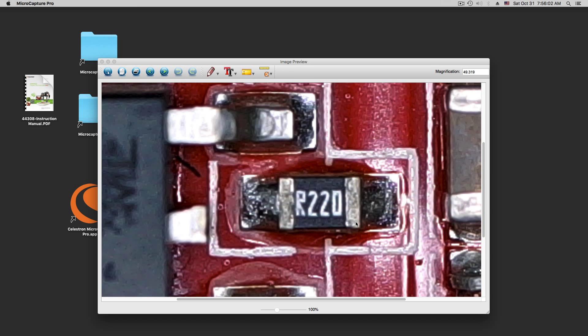Now if I drag a line from here to here, let's say from here to here. Are we crashing? I noticed that this program likes to crash. Oh no, there it is! We could do undo button here. Look how fast this program is. This I cannot undo.